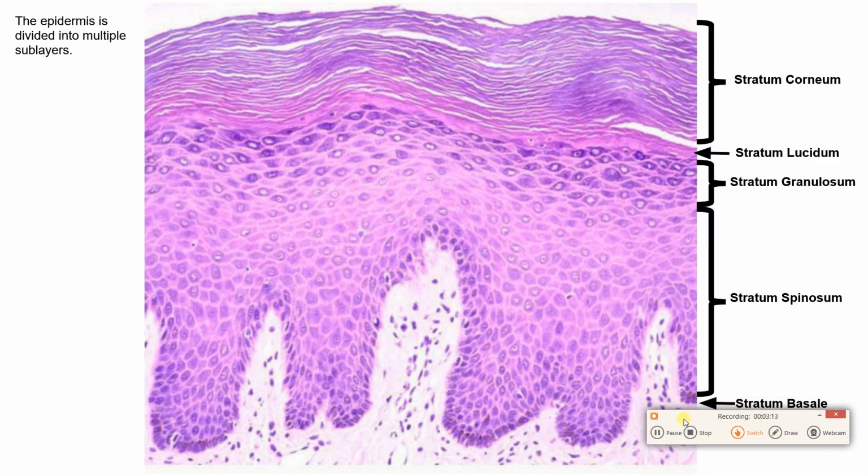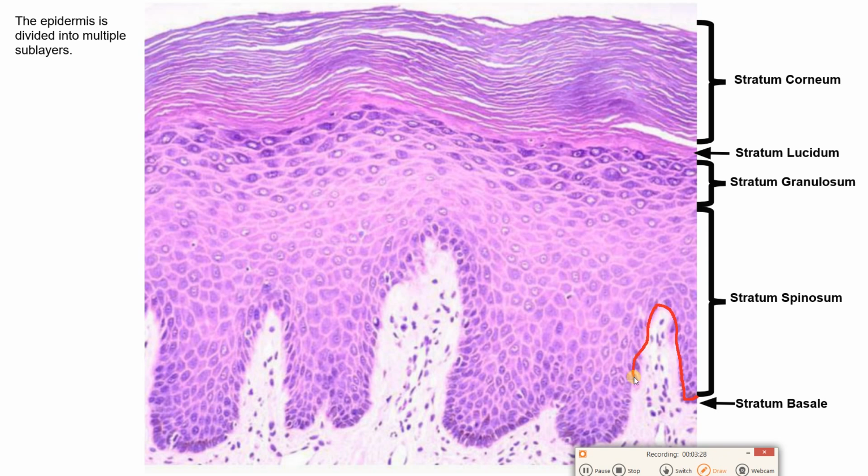Now, what we do with this epidermis is we actually divide it up into sublayers. So, at the very deepest part, the basalmost row of cells in the epidermis is called the stratum basale. Stratum just means layer, and then basale means basalmost. So the base layer, in other words, is the stratum basale. And I'm going to cover just about all the stratum basale here. There we go. Messed up a little bit right there, but you get the drift.